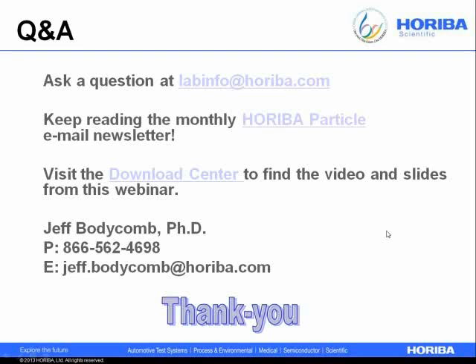Yvonne has asked, what's the best way to take into account the refractive index and its imaginary component? Do you measure this in the lab, or do you use a reference value? Well, I'm in a happy world of nanoparticles where I don't have to worry as much as laser diffraction. Yvonne, when particles are quite small, refractive index effects become much weaker. And so what happens with nanoparticles is that you use a close enough estimate, and that works. This is different from laser diffraction.